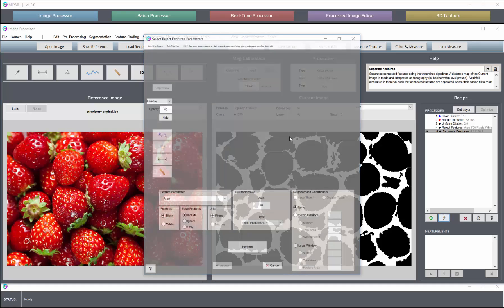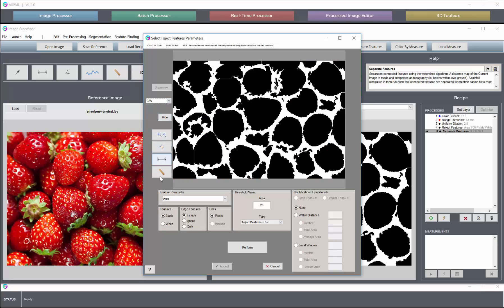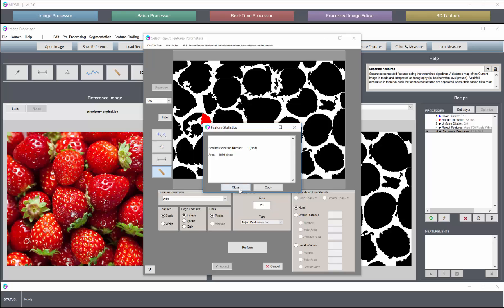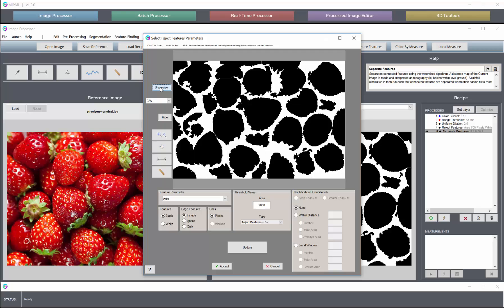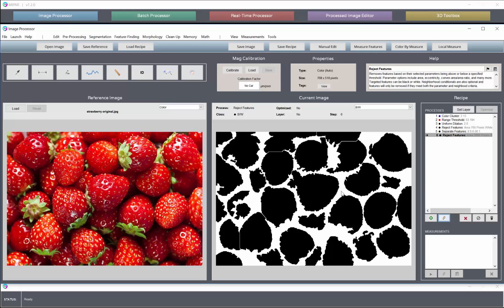And lastly, we might reject small features. I'd say anything less than this we don't want to count as a berry. We may want to ignore edge features altogether at the end. That's typically up to the researcher.